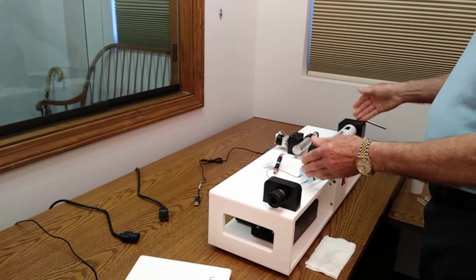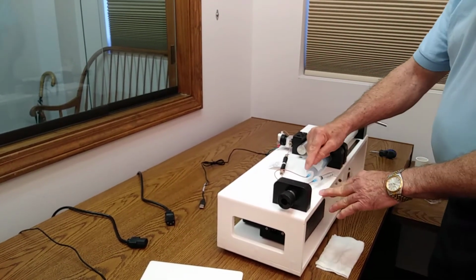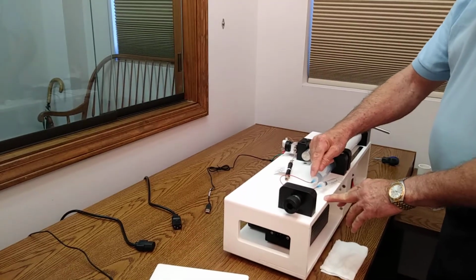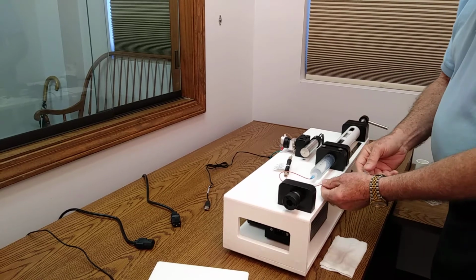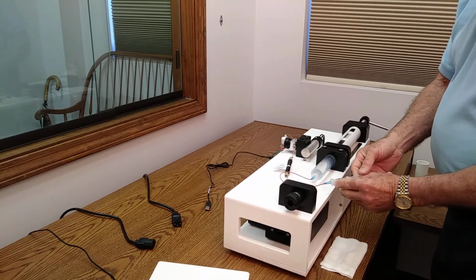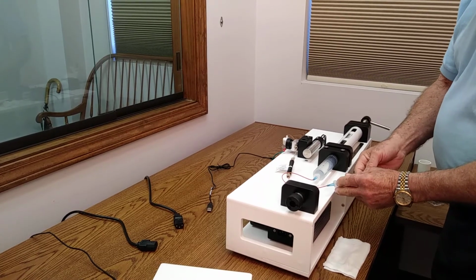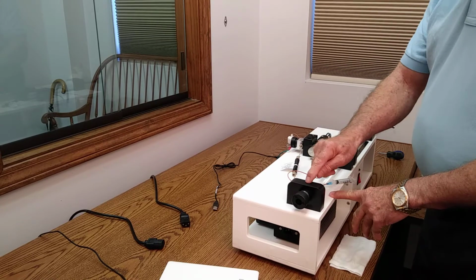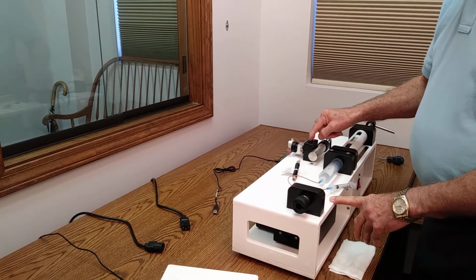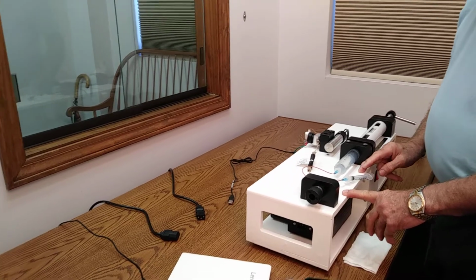So we've talked about the system. This is the pump which we've been addressing. There's a 0.45 micron filter filtering the eluent. This is a syringe where we'll introduce sample. Also, we have the same 0.45 micron filter here. The idea is to keep any kind of particulates out of the injector, the column, and the detector. And with this approach, we should be successful in doing so.